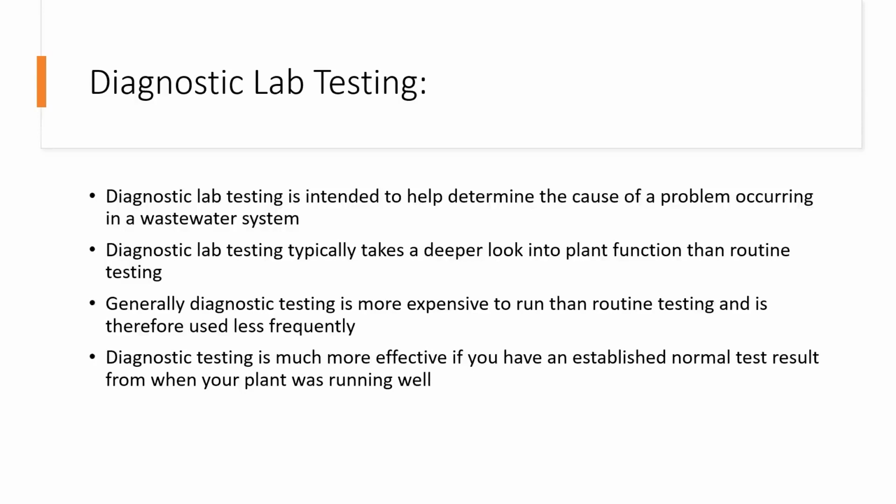Whenever your plant is operating well, you might want to send out some samples for diagnostic lab analysis to a couple of sites. And it's nice to do this at different times of year as well. So say your plant is operating well in the fall, it might look quite a bit different microscopically and have a lot of different characteristics than when it's functioning well in the summer, because the bacterial population and characteristics of your plant are always evolving at all points in time.